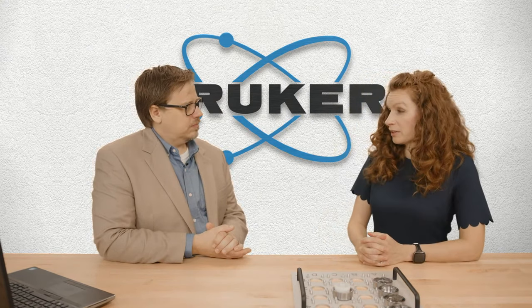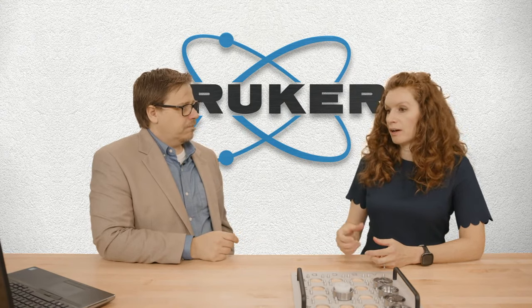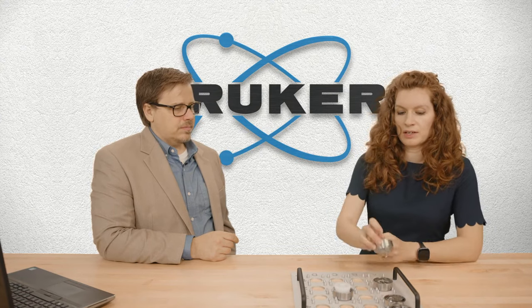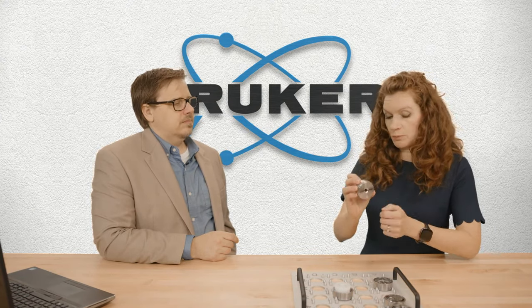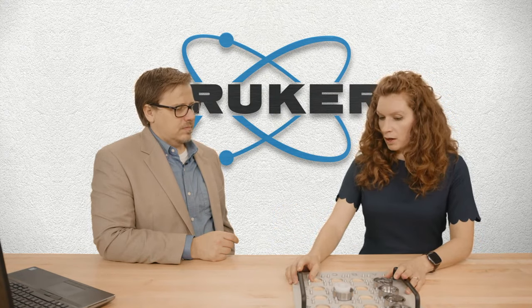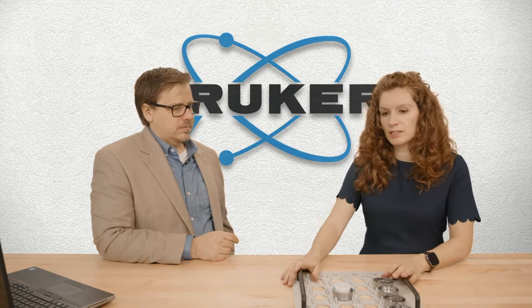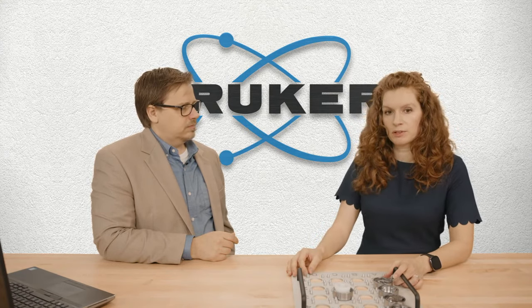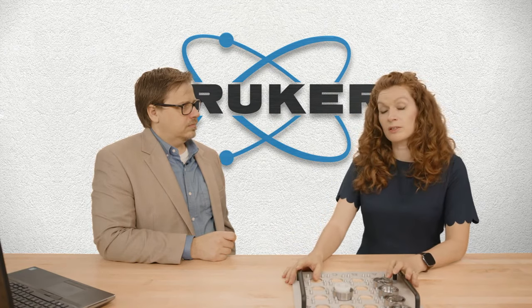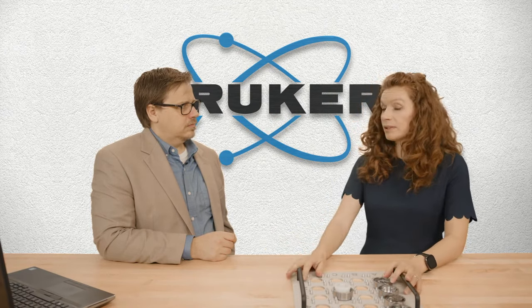We also have a slightly different configuration that's more of the traditional sizes that you see in the metal industry. They are larger, so Dan will actually show that later in the lab. Those are the two-part cups, and there you can exchange the base plate to smaller sizes. So these are the more common configuration that we see just because it's so easy, but if you have larger samples or other reasons for going for the two-part ones, for example, if you want to do mapping, then that's available as well.